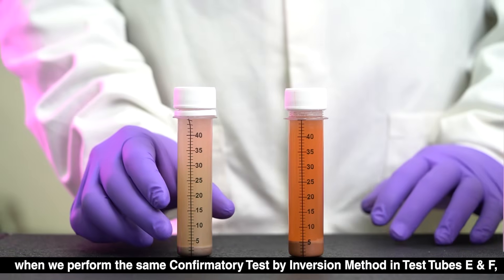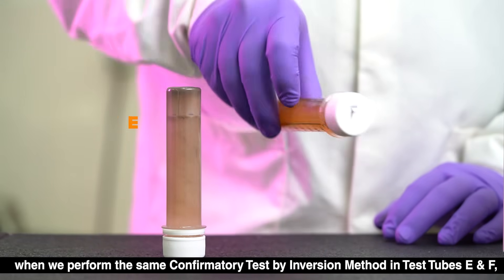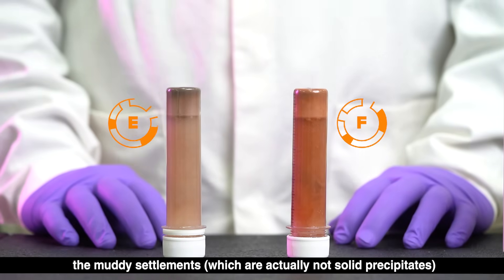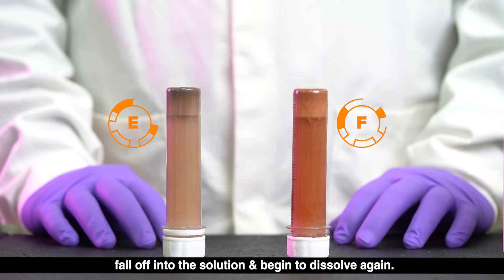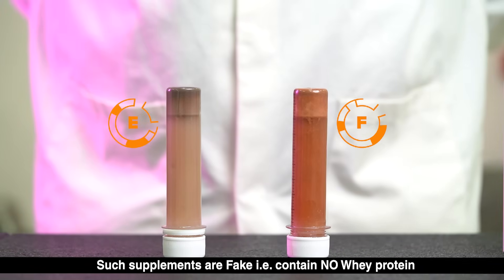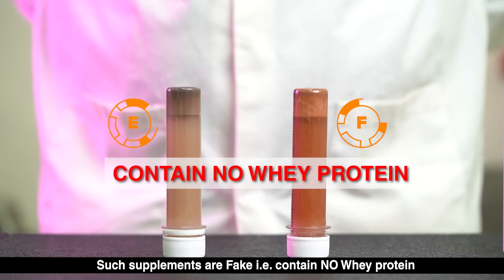When we perform the same confirmatory test by inversion method in test tubes E and F, the muddy settlements — which are actually not solid precipitates — fall off into the solution and begin to dissolve again. Such supplements are fake, that is, they contain no whey protein.